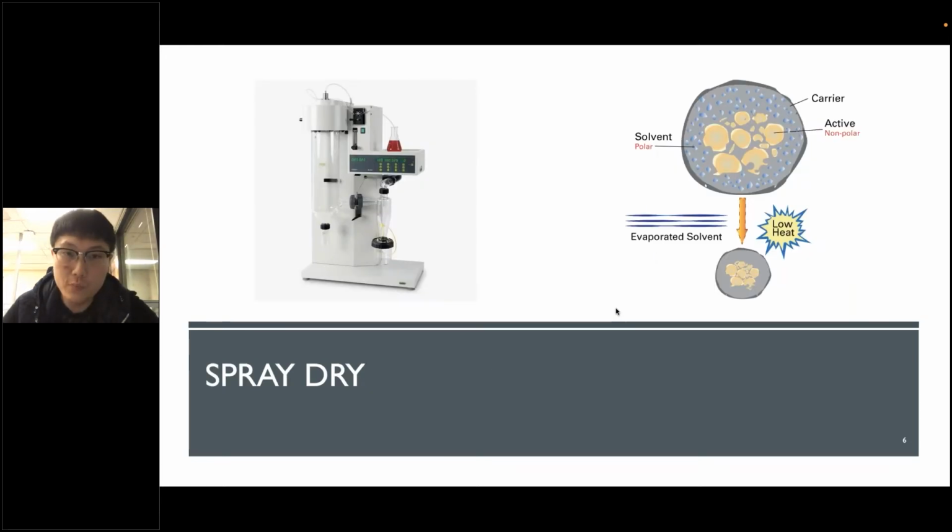So that's why I chose spray drying as the technology in this research, as mentioned before by Alberto. The process of the spray drying itself is encapsulation, so there is no need to add this kind of bulk agent, so the loading content can remain.